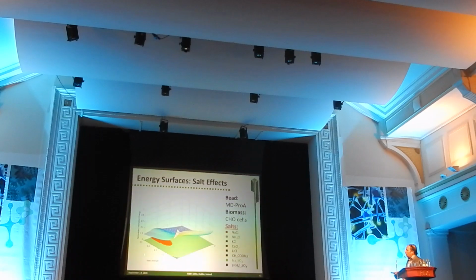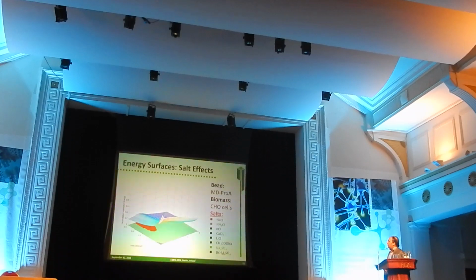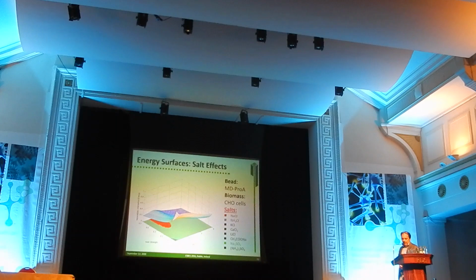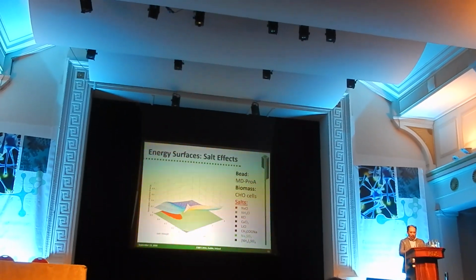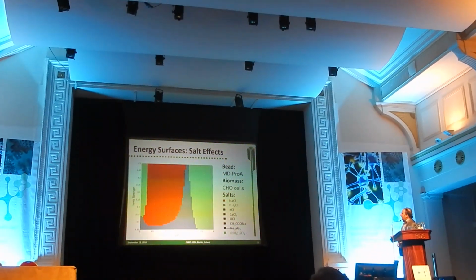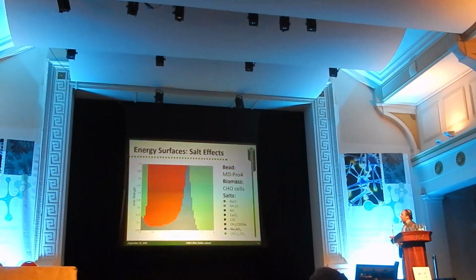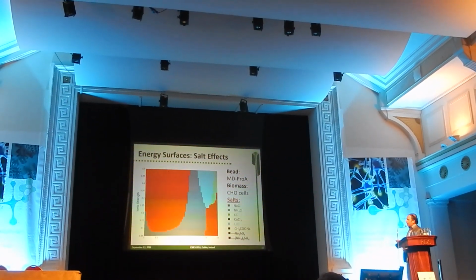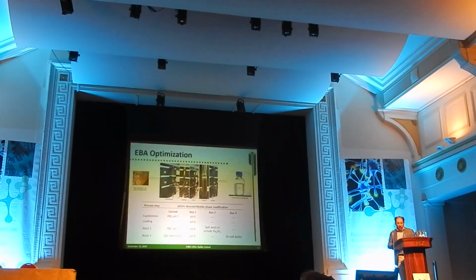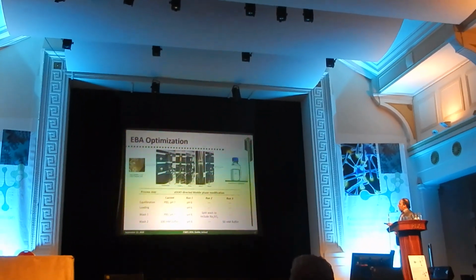which are critical for operation, which are total ionic strength of the buffer or feedstock, pH of the same, and the composition of salts that you have in this buffer, in this culture media, or whatever feedstock you want to apply. So we can actually, in the calculations, remove or add salts in order to find optimum spaces for the process. And we went into testing this in real practice with DSM Biologicals in the Netherlands. And this is what we did.